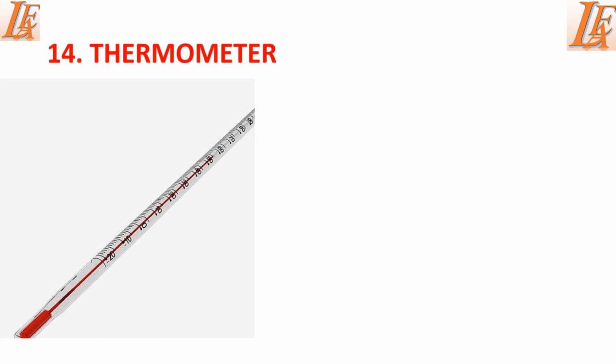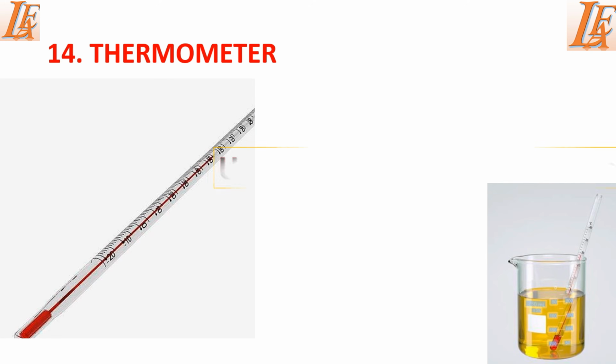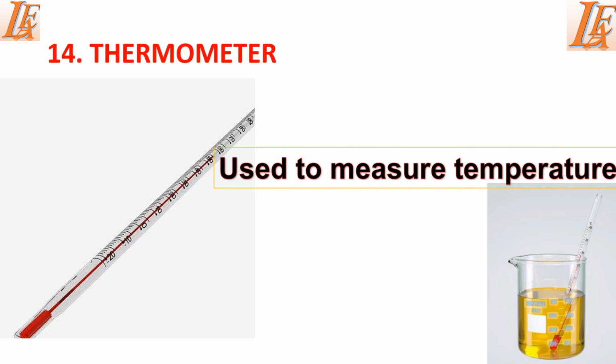Another apparatus that we have is a thermometer, and a thermometer is an instrument which is used to measure temperature of substances in the lab, and most of the time the thermometers that we have are calibrated in degrees Celsius.